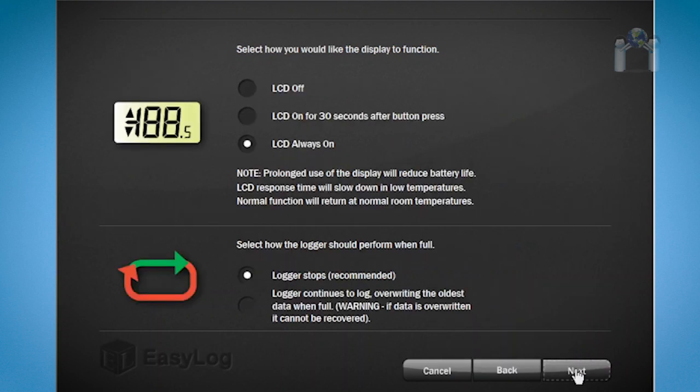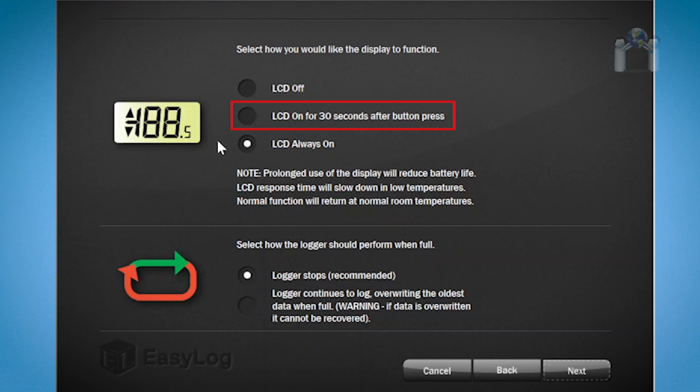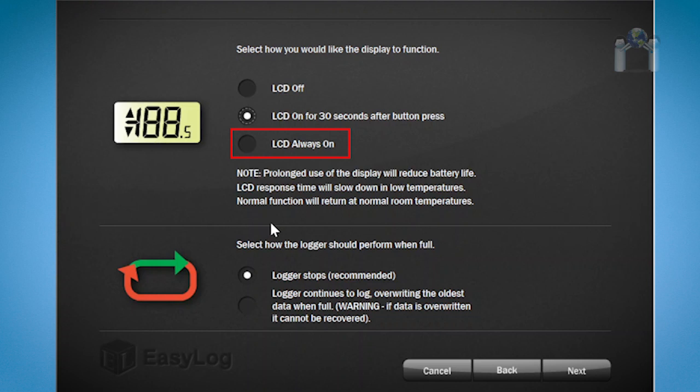The next window is for configuring the LCD display and what the logger should do when the memory is full. You have three options when configuring the LCD display: LCD is to remain off, even after a button press. This is a good option if security is an issue. The LCD is on for 30 seconds after a button press. This is the most common setting. LCD is always on. In this demonstration, I will choose the second option. Take a moment to read the message below the LCD display configuration regarding prolonged use of the LCD and its behavior in cold temperatures.